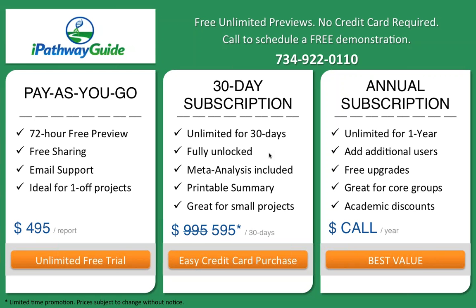Maybe you've got some data now, and maybe in 6 months from now you expect to have some additional data. You can get another 30-day subscription then, and then compare those two during that period. And so that's a great way to save money if you have a small project or maybe a lower volume lab.